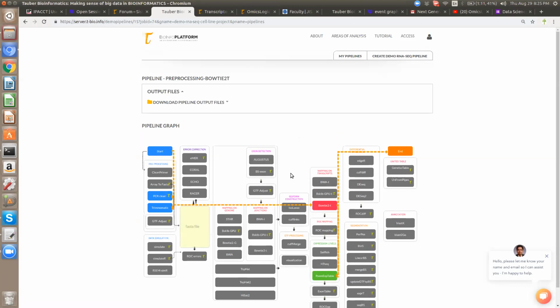The first thing is that you have to understand what kind of files have to be uploaded onto the server. That is why we have created this demo. And also, this sort of pipeline takes quite some time to run, let's say 1.5 days or 2.5 days or something like that. So before actually going into the ocean to swim, it is better to learn swimming in a pond. This is why we have done this demo pipeline, so that you know the basics of swimming, and then go into the bigger picture and deeper waters to really take the swim. Does it answer your question?